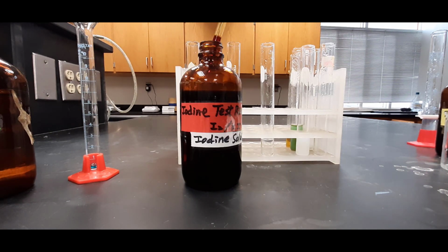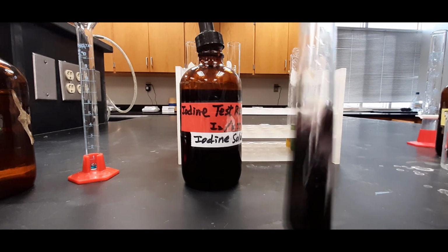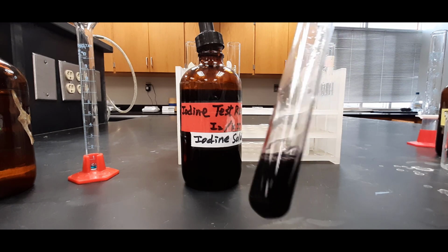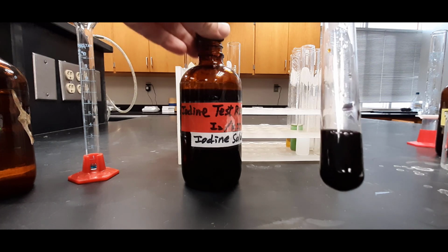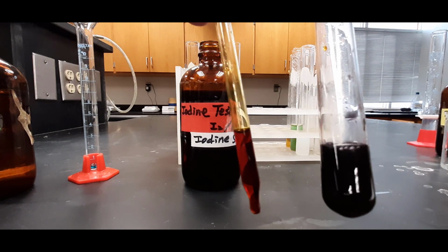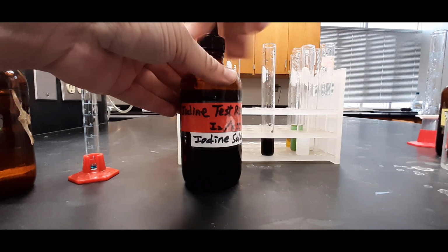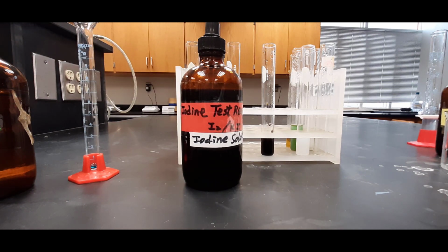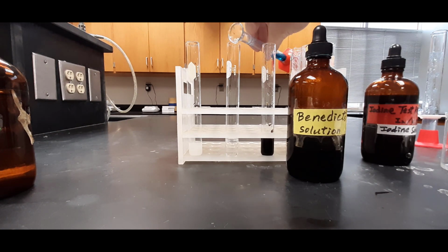Next, I test for starch using the iodine solution. And last, I test for glucose using Benedict's solution.